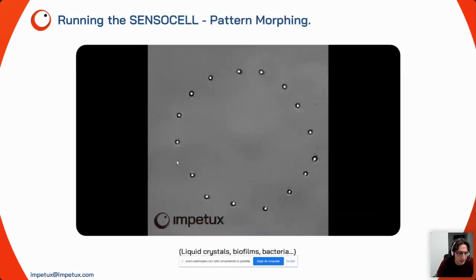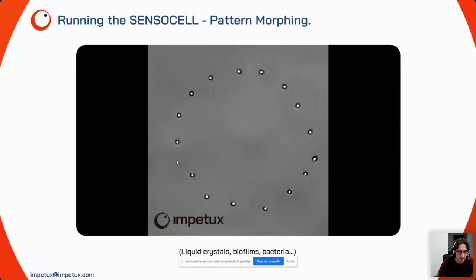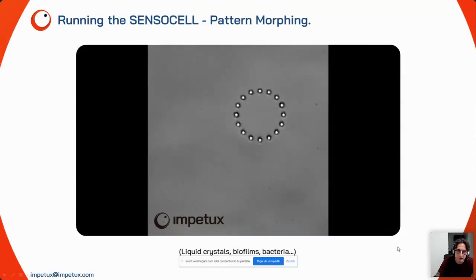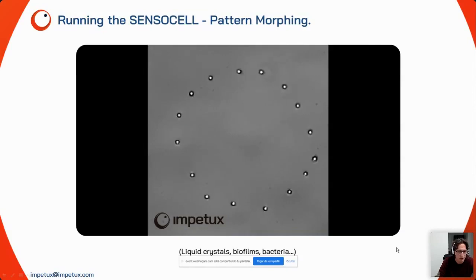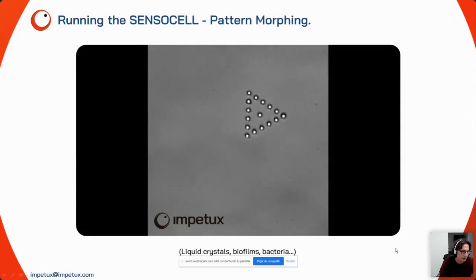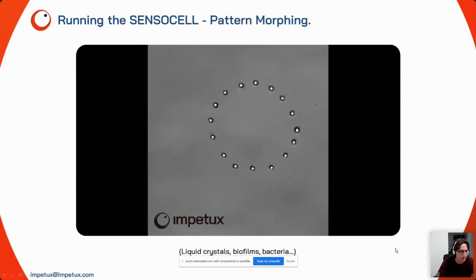To show the complexity and flexibility of the system in terms of manipulation, here is the pattern morphing built-in routine. We have 16 trapped microspheres with space and time coordinates entered for different patterns, and the system moves from one pattern to another. This might seem like a fancy feature, but it was requested by clients working in liquid crystal physics, biofilms, and bacteria motility — so we built this routine for them.